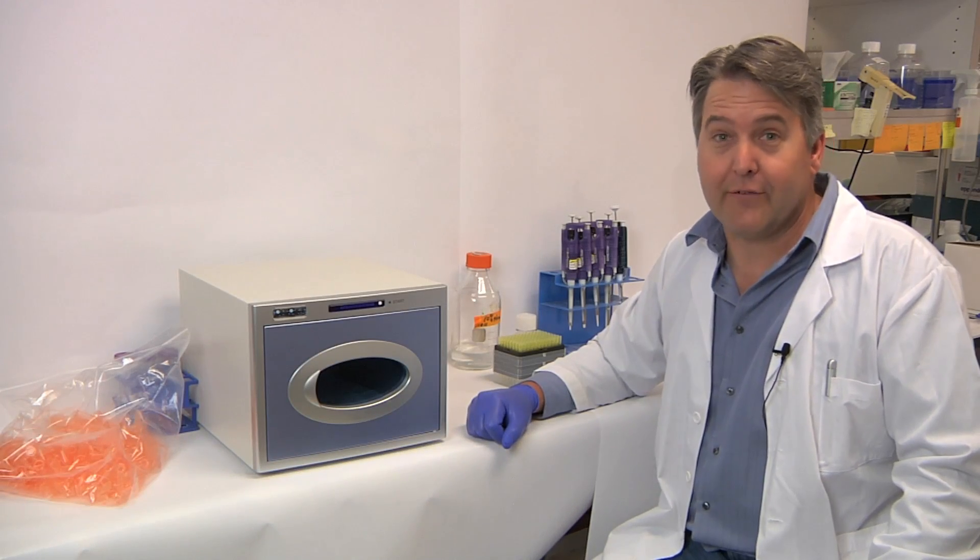Hi, I'm Steve Jurak with Genlantis, and today I'd like to introduce you to the Koolclave Personal Benchtop Sterilizer.